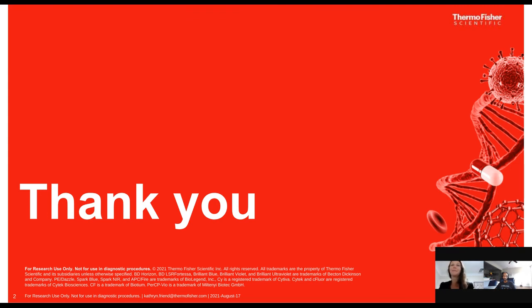This is a really good one. Do NovaFluors generally eliminate the need to do compensation? If compensation is still needed, does it need to be performed on every new batch of antibodies, just like with tandem dyes? It is a good question. Anson, maybe you can help me with this, but NovaFluors do not eliminate the need to do compensation. This is good practice. I would always recommend you do compensation for every dye.